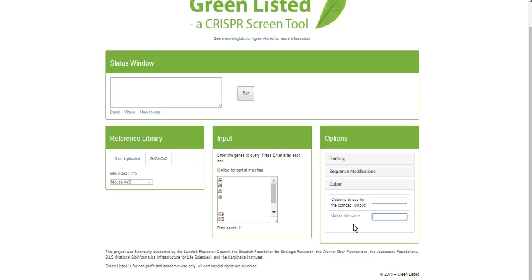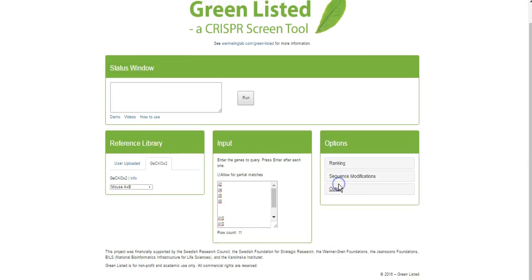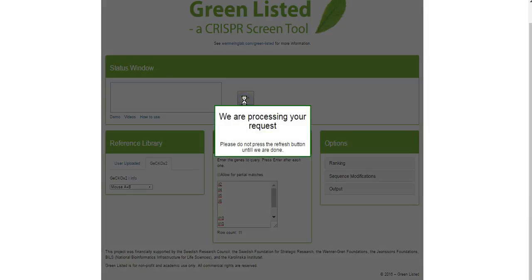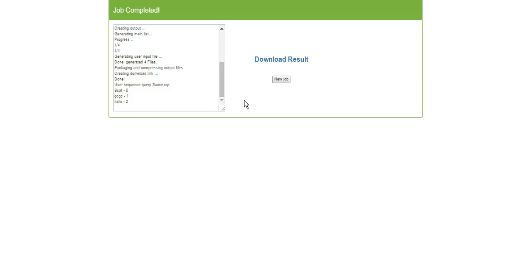In the output section, it could be useful to introduce a name so you can easily find your results later — for example, today's date in Swedish, or a test label. So we have our reference library, the genes we want to use, the options set — some ranking, sequence modification — and we've given it a name. Then we press Run. It was pretty fast here, but it can take a little while if you have a very complex or long list of genes.